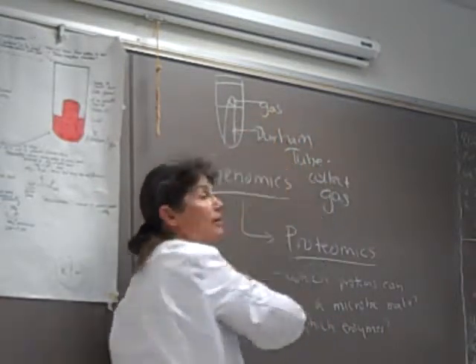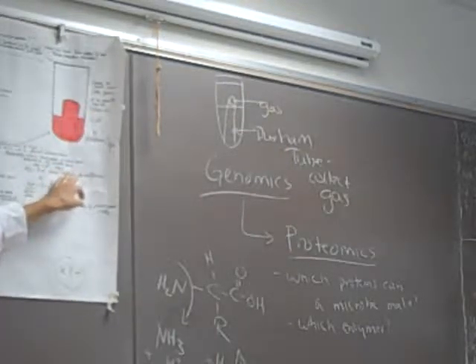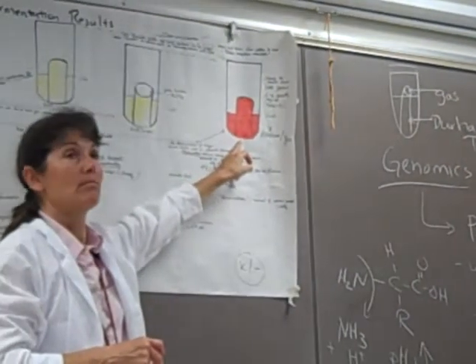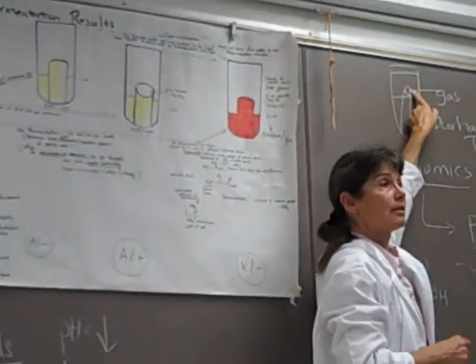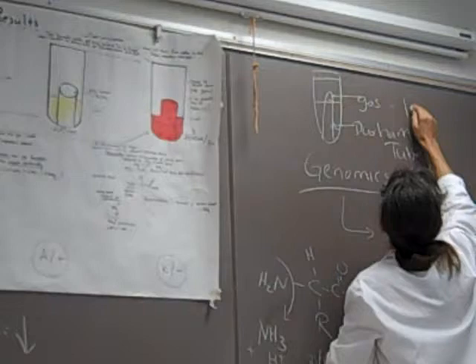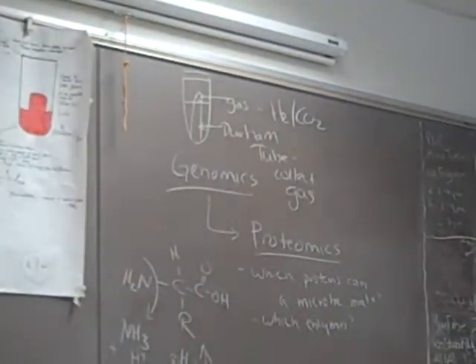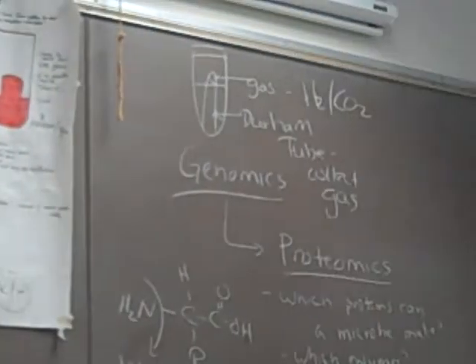record not only the color of the medium, is it yellow, indicating acid production, or is it deep fuchsia, indicating that we had a base produced, a base produced from deamination of amino acids. You'll always also look for a gas bubble. Okay? And again, you guys, if we have gas present, what would the gases be? Molecular hydrogen or CO2. Those are the most common gases produced during fermentation. Okay, so let me back up here, and I've forgotten which this belongs to.